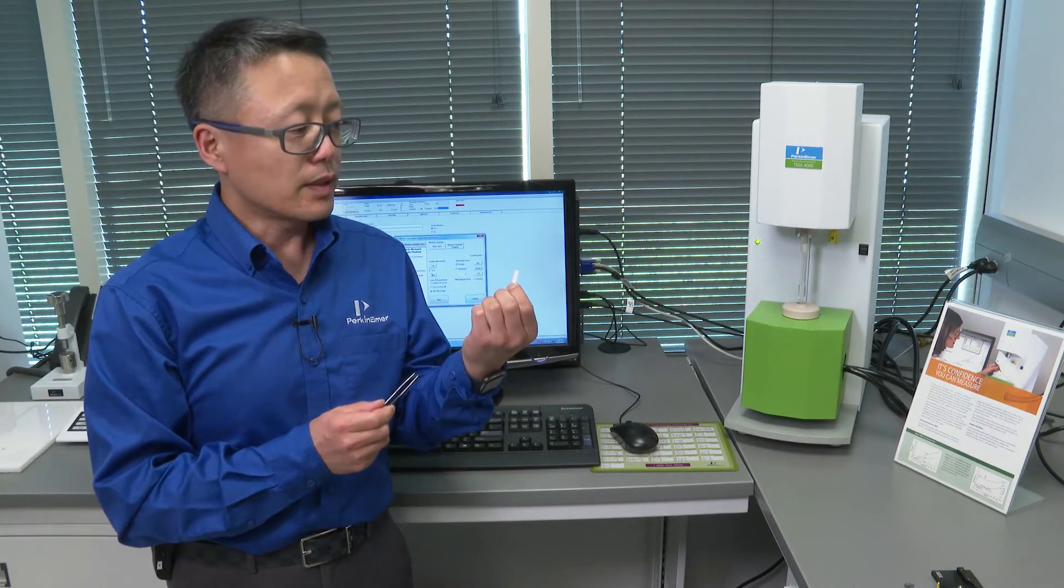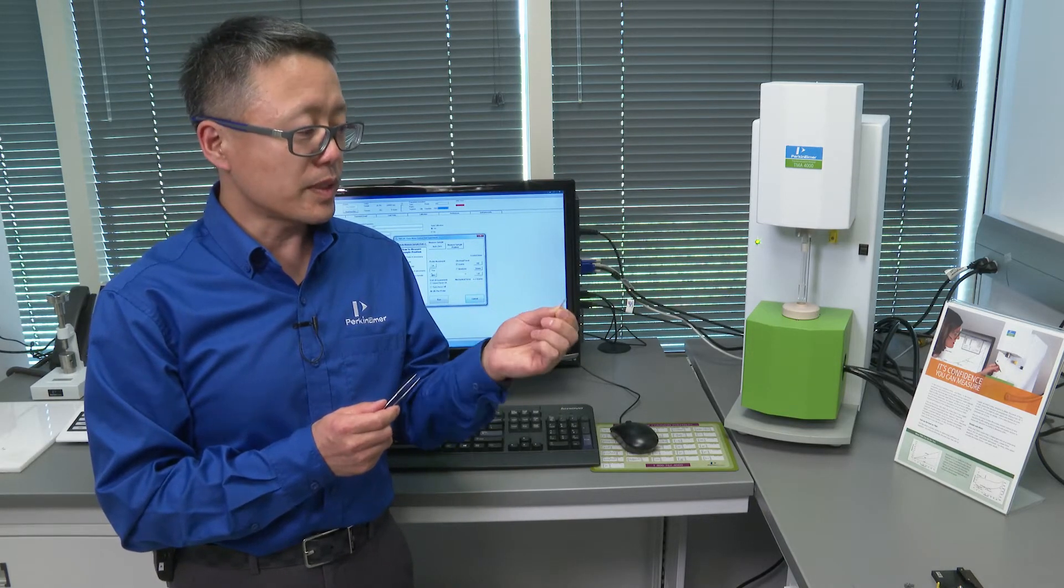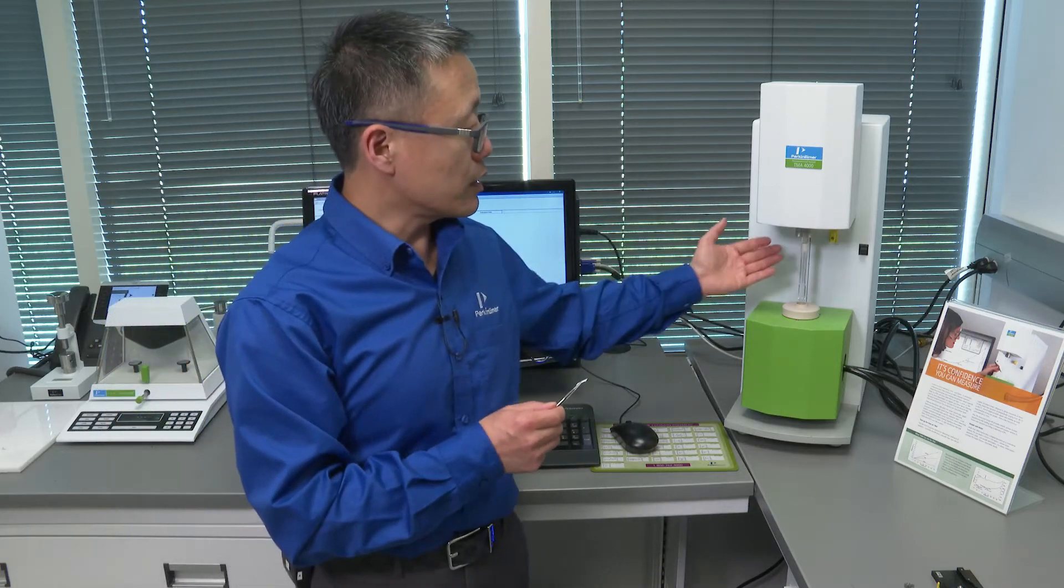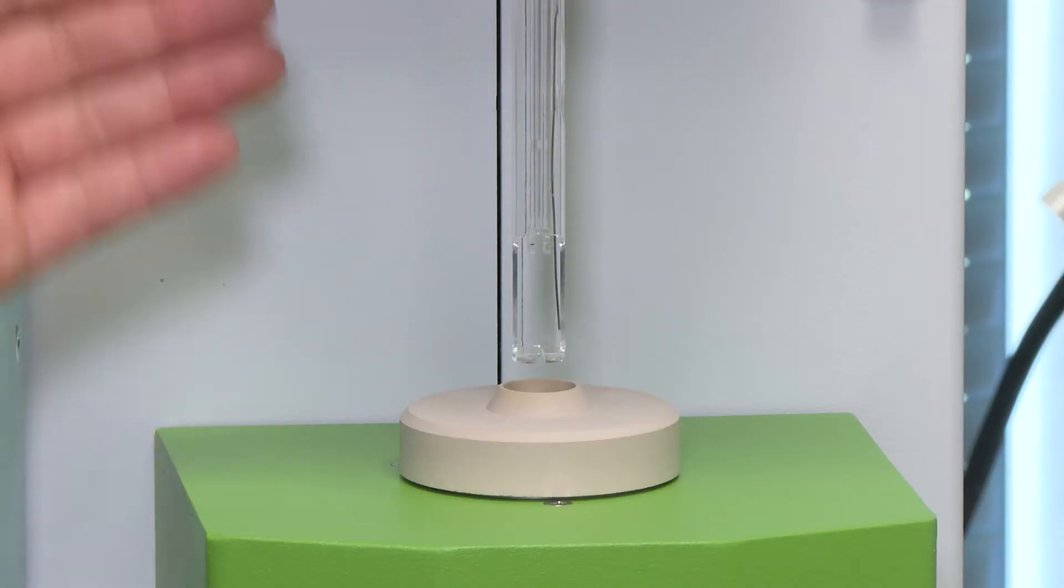This is an example of what a film sample looks like. I have changed the fixture to a tension fixture.